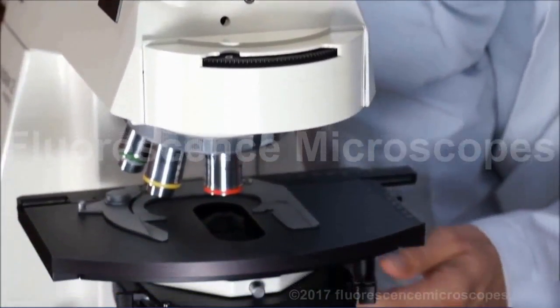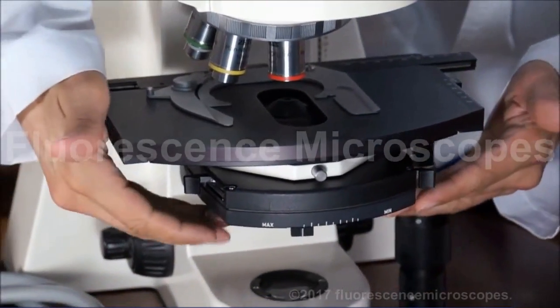We've got a universal condenser. Here's the condenser centering knobs.